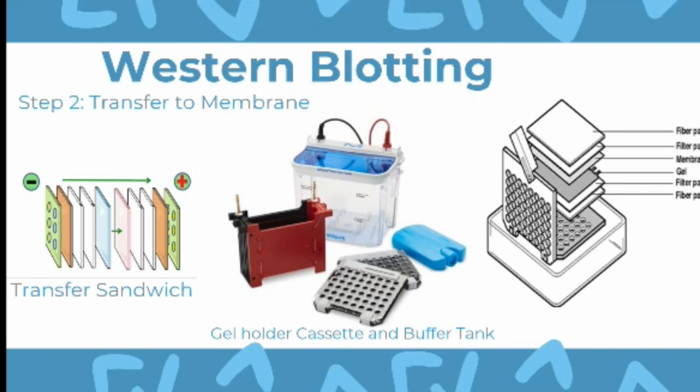So this is a simple setup. This is the cassette wherein this transfer sandwich is meshed together and placed into this cassette. This cassette is placed into this holder, and thereafter is placed into the buffer tank where electric current is applied to send the proteins from the gel into the nitrocellulose membrane.